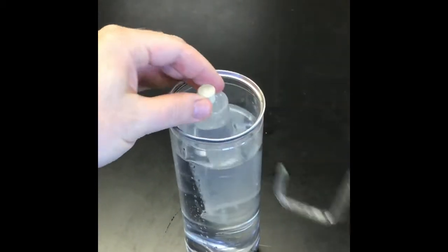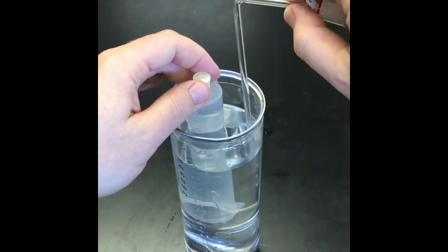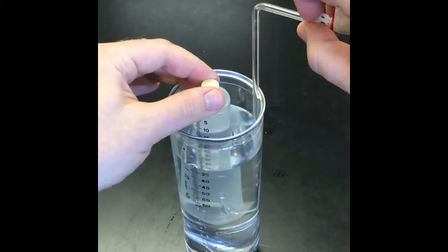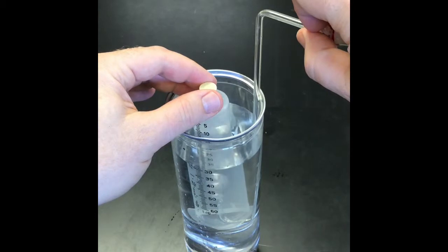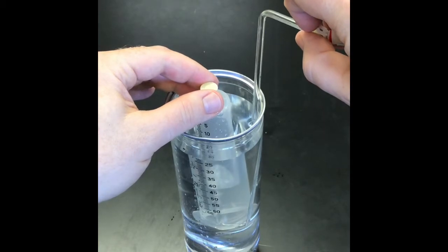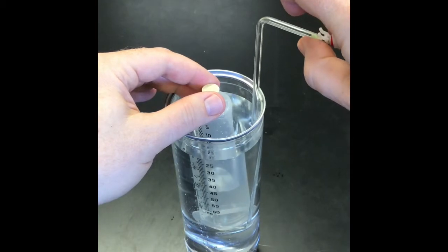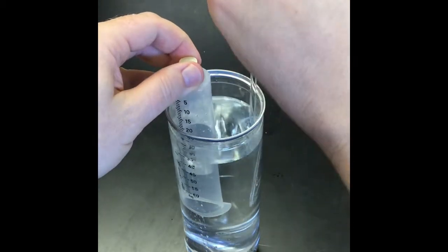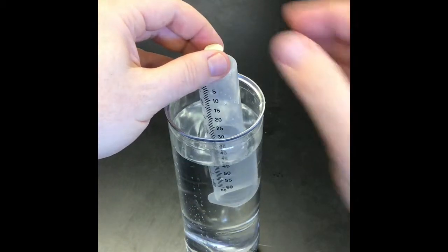So we're going to take the J tube and put the bottom part of it inside the syringe, and then I'm going to carefully press down the white tab and dispense butane in here. Now I want to make sure that we don't put too much in, and it may come out fast, and you can see it going up top there and collecting. It's pushing the water down, and when it gets to around 40 or so, I want to let off of that, and you'll get a little bit of residual gas going in there. And then I'm going to take the J tube out, and I'm going to read the volume of the gas.